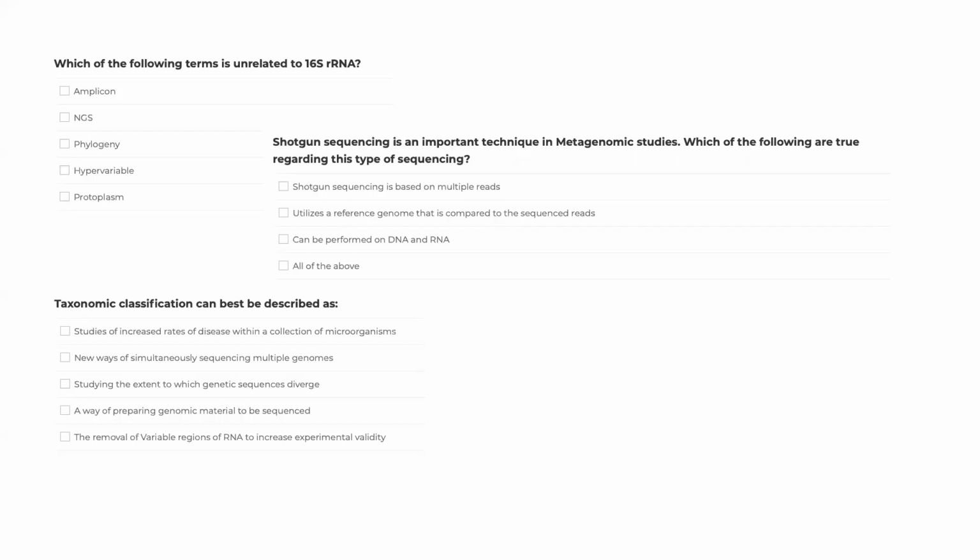All right, excellent. So all of you, I see, have a lot of background information already on metagenomics. Taxonomic classification is a way to study metagenomic communities, and we use shotgun sequencing, so it's important to understand some terminology related to what this technique actually does.